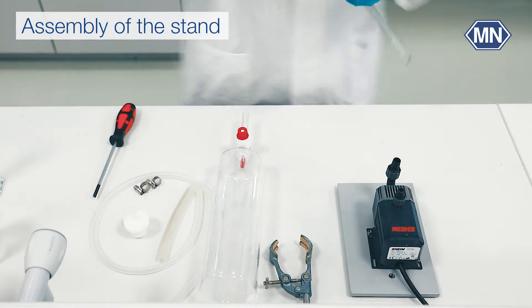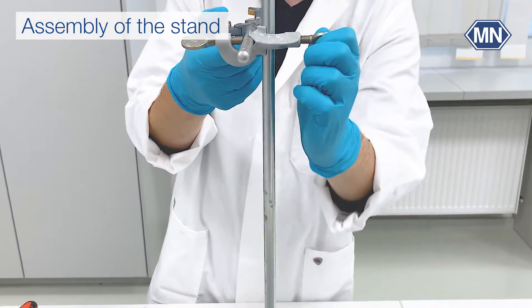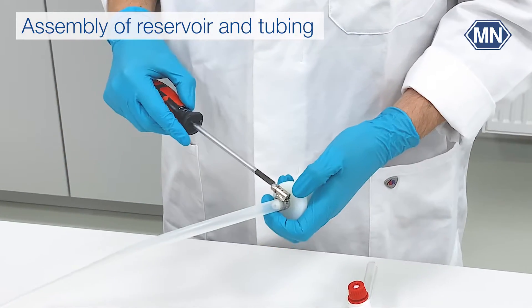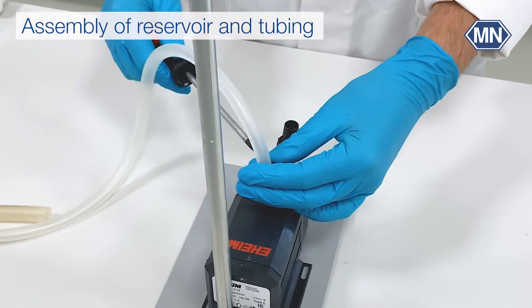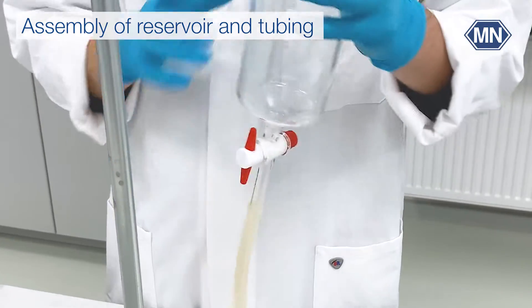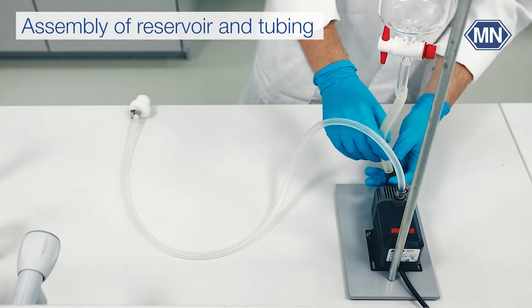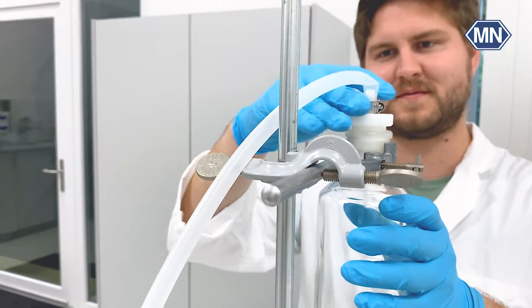Let's start with the assembly of the pump. First, assemble the stand. Connect the adapter and the pump via the longer tube by using a clamp. Use the screwdriver to tighten both clamps. Attach the short tube to the reservoir and mount it to the stand. Adjust the height and connect the short tube to the pump. Finally, attach the adapter to the reservoir.